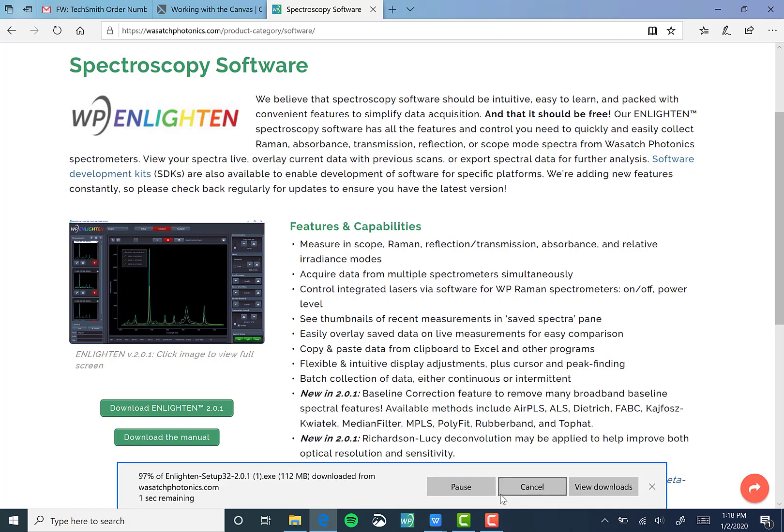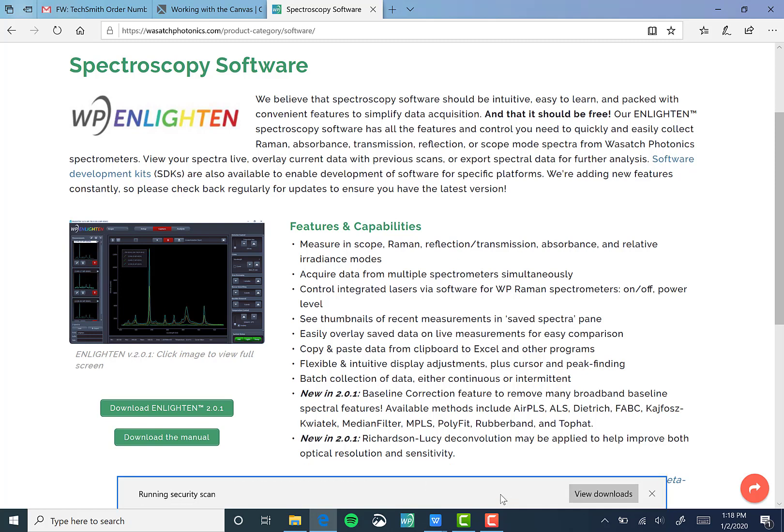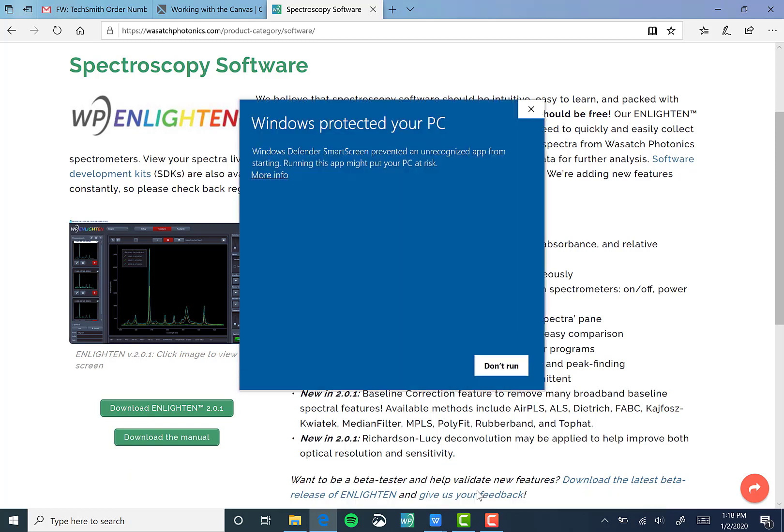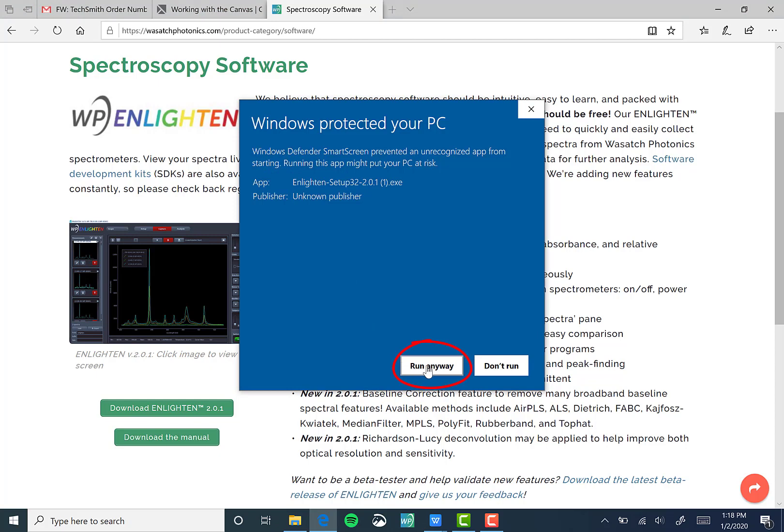After the file has finished downloading, you'll want to click Run. A window will appear that may seem like Enlighten cannot be downloaded. However, click More Info, as shown here, to select Run Anyway.